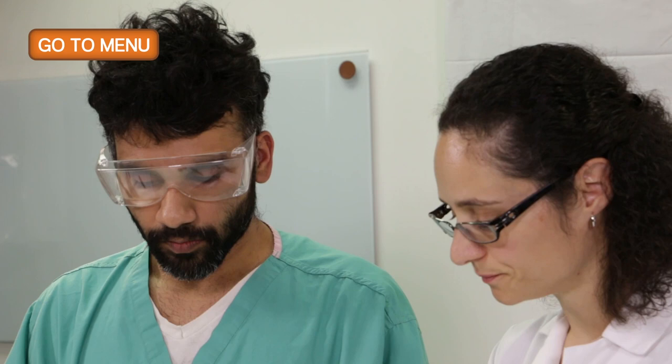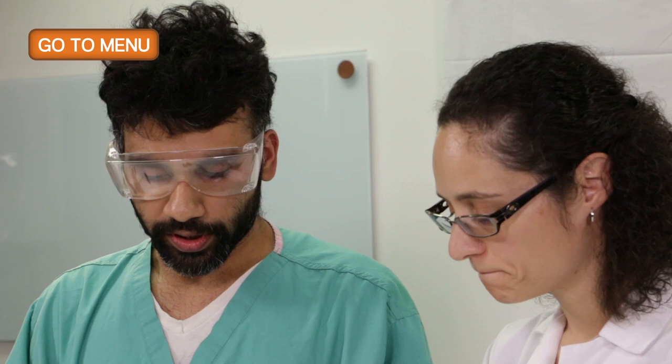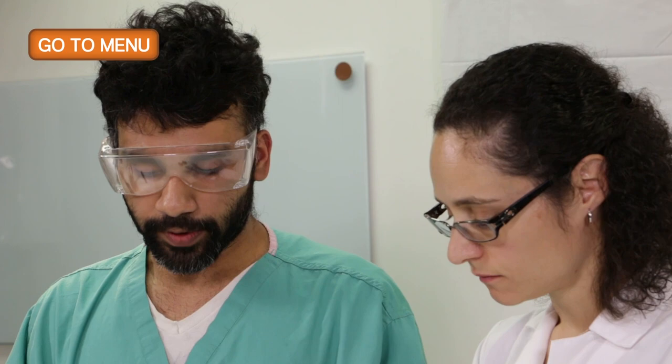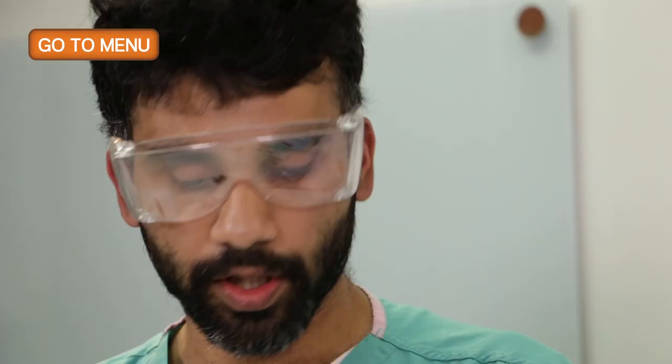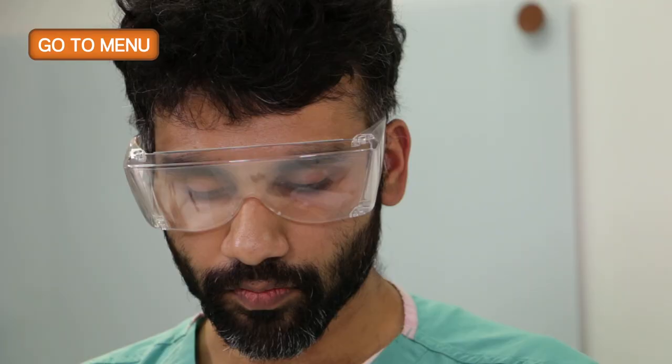Typically, it depends again on the size of the lesion, and also whether it's encapsulated or not. If there was a fibrous capsule that we could see, then you would want to submit the capsule in its entirety. Correct. If it's an encapsulated lesion, you want to submit it entirely, because often the only way to tell the difference between benign and malignant is to look at the capsule, for capsular invasion or vascular invasion, which you can't see grossly. So you'd have to completely submit the entire periphery of the nodule, the capsule with the intervening normal parenchyma.